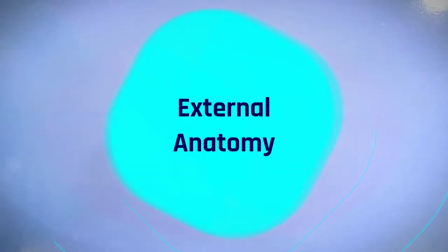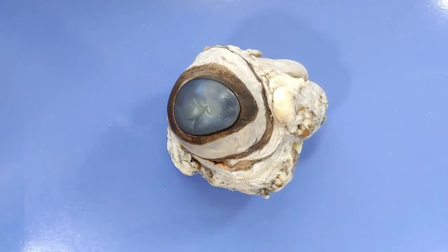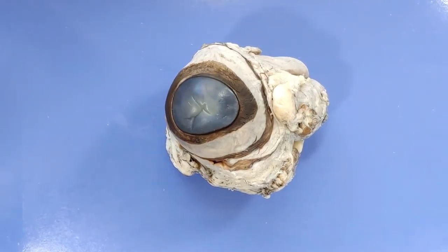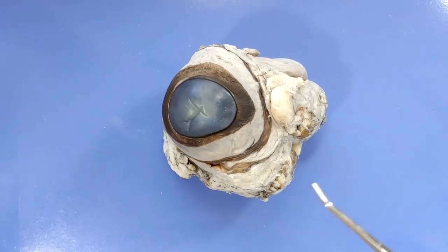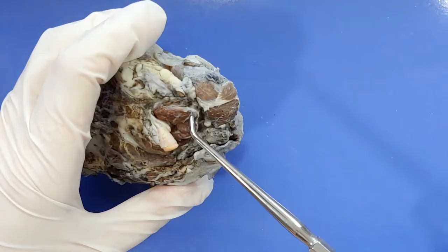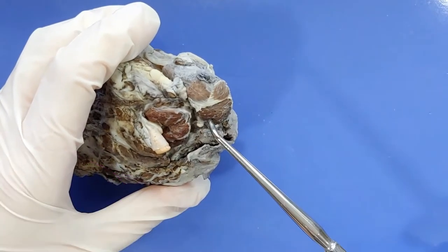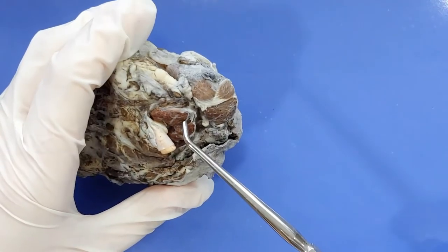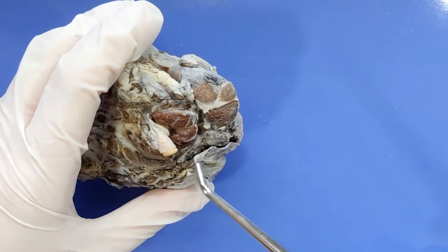So now let's take a look at the external structures. You can see that the eye is covered in a layer of fat and muscles right here. I'm going to remove most of these later, but first I want to point out these muscles here. These are the muscles that move your eyes, and they're actually the most active muscles in your body. It has been estimated that the eye muscles move more than 100,000 times a day.